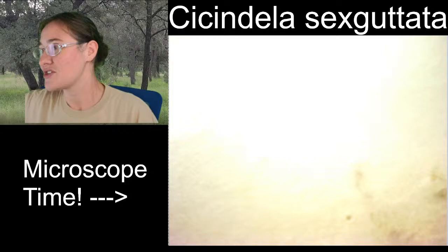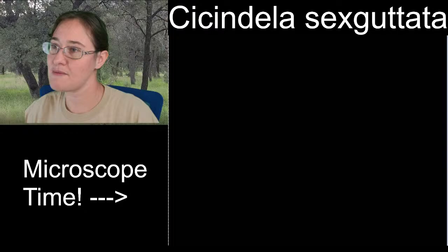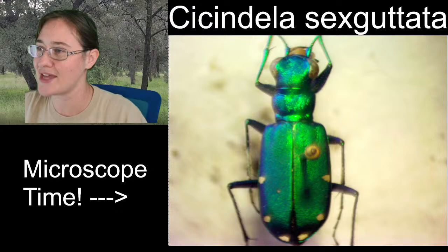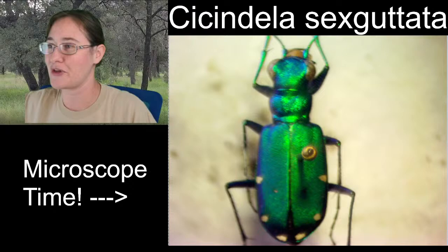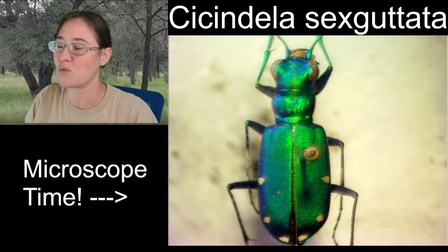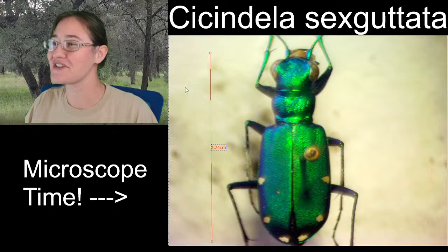So we're gonna, I bumped my specimen. Come on back. All right, this is as far as I can zoom out on the microscope, and that actually doesn't look too bad, so we're going to get it into focus, and we'll be able to see actually most of our body under the microscope. Okay, I'm pretty happy with that, and actually, because we can see it, I'm curious how accurate my reading was. We had mentioned somewhere between 1.2 and 1.3. Look at that, 1.24 centimeters. We were so close. I said 1.25.